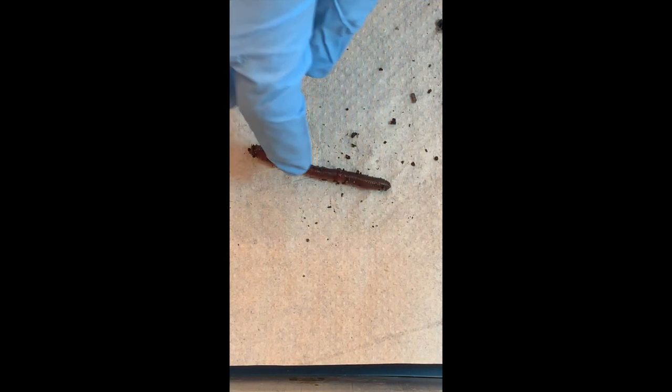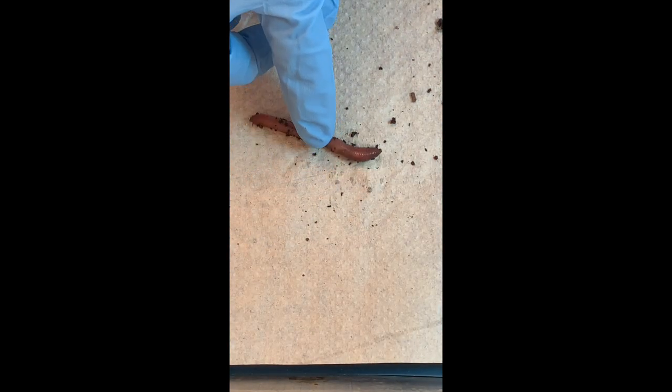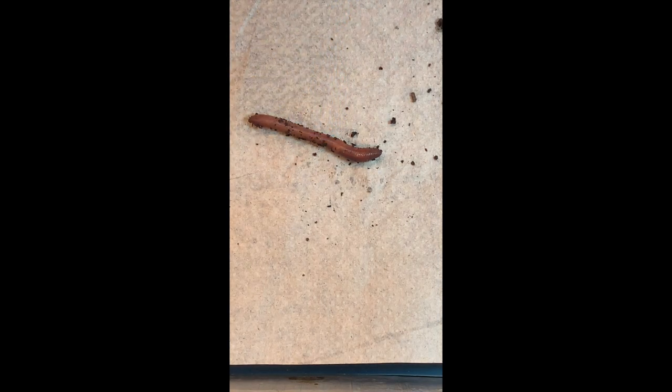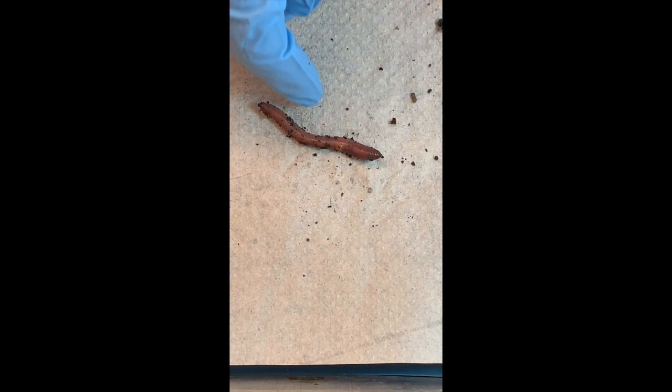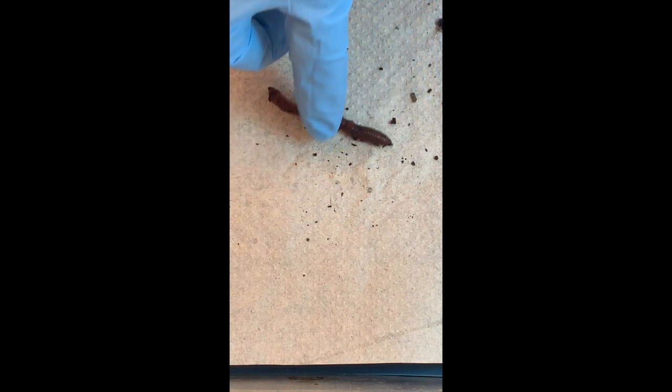And earthworms have what type of symmetry? Maybe asymmetry? No, that seems pretty regular. There are three types — maybe it's radial, like our cnidarians, like jellyfish? Nope. They are bilateral. It's always hard to see in worms because they just look like a tube, and that's their body plan — a tube within a tube. The inner tube being the digestive tract.